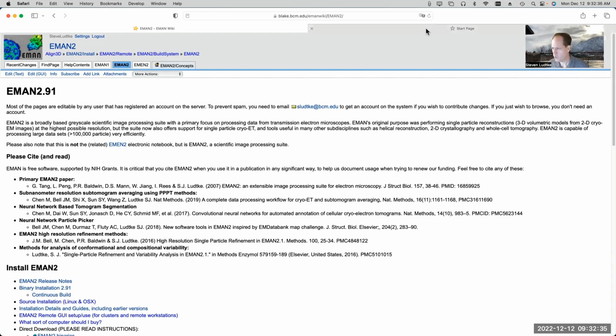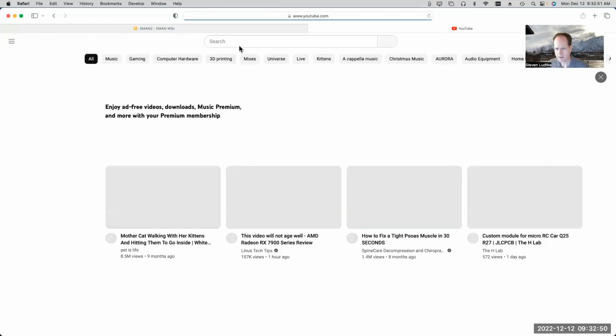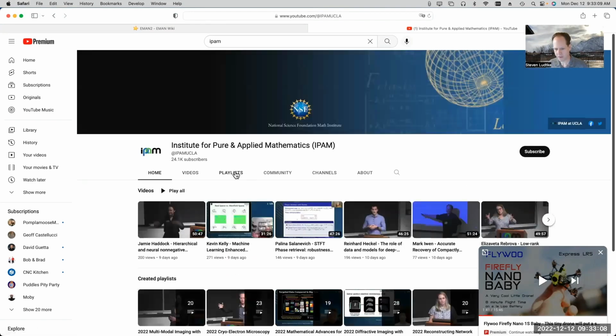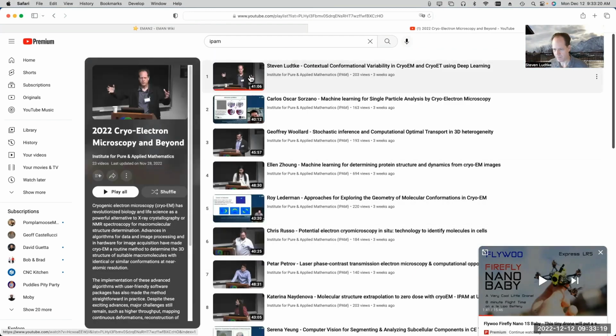So if you want to know more about the theory, the paper that was published last year in Nature Methods is a good source. Also, if you go to YouTube, I gave a talk at IPAM at UCLA recently. So if you search for IPAM and go to the Institute for Pure and Applied Mathematics playlists, all of the talks from that meeting that we had just a couple of weeks ago are available there. So that IPAM talk is a pretty good background to the theory.